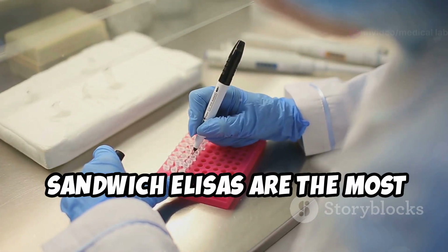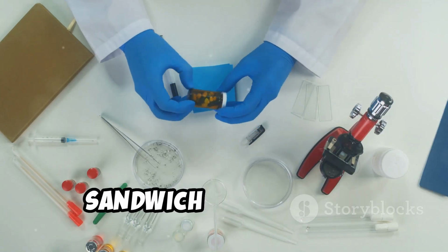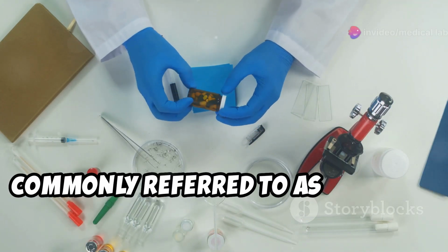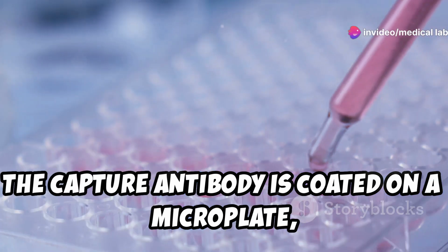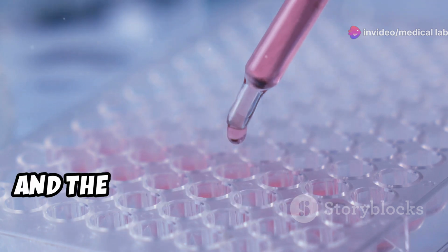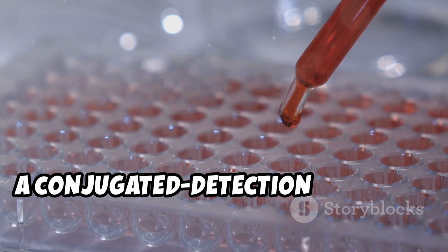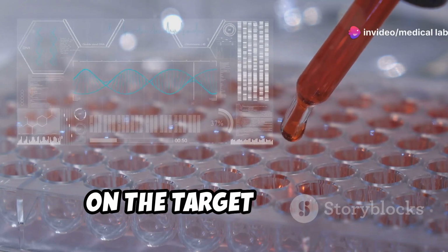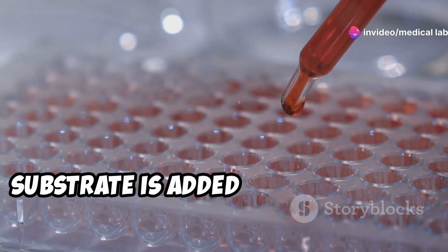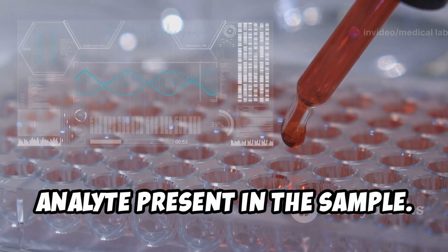Sandwich ELISAs are the most common type of ELISA. Two specific antibodies are used to sandwich the antigen, commonly referred to as matched antibody pairs. The capture antibody is coated on a microplate, the sample is added, and the protein of interest binds and is immobilized on the plate. A conjugated detection antibody is then added and binds to an additional epitope on the target protein. Substrate is added and produces a signal that is proportional to the amount of analyte present in the sample.